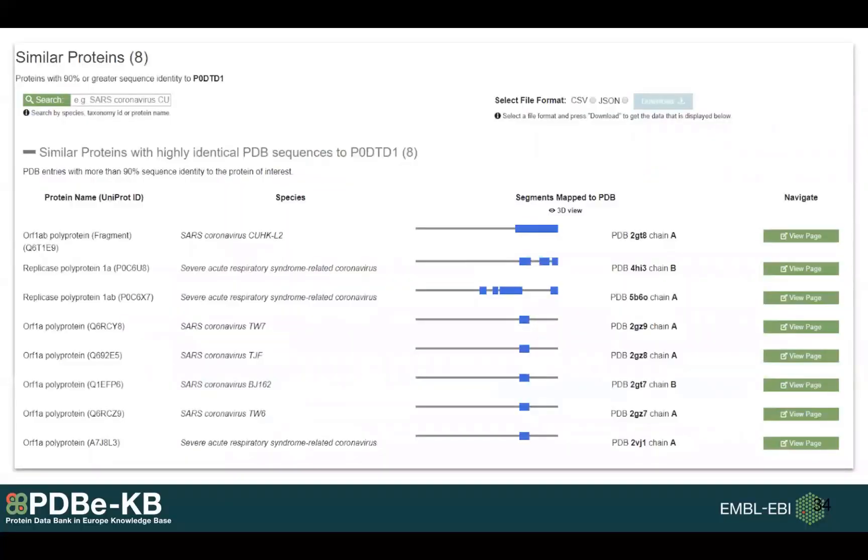Finally, we have a section for similar proteins. In the case of coronavirus, what we can show here is, are there any other UniProt accessions? So this is the UniProt accession of the coronavirus protein. Are there any other UniProt accessions which have PDBs mapped to them that are at least 90% identical to any PDBs mapped to this one?